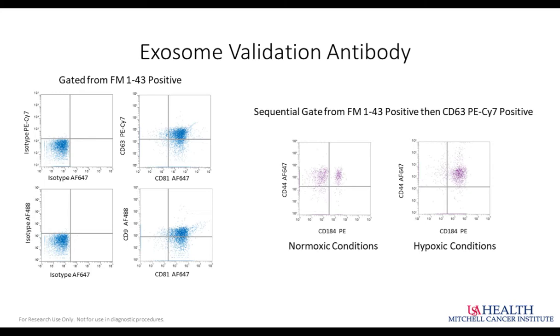So those are just representative figures of the kind of data that we're generating. One quick comment on the choice of fluorochromes. You must strive to use only the very brightest fluorochromes, those being the polymer violet dyes, phycoerythrin, the Alexa Fluor dyes, especially 647. It's hard to find, but sometimes one of my favorites is also Alexa Fluor 546. It's also one of the brightest ones.